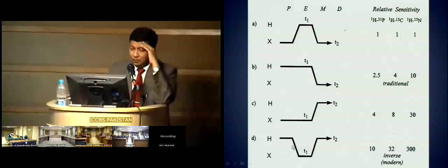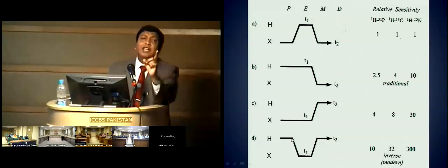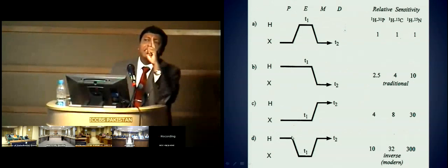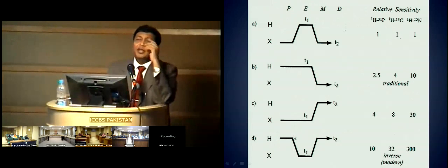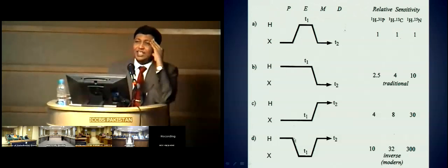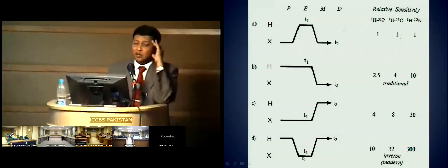Now here you have an interesting experiment in which you have a source nuclei as proton. Proton is transferred by exactly the same thing as you have done, INEPT. Kindly never forget INEPT. You may forget anything in the world, but never forget INEPT. So you have this INEPT, and you have this particular antiphase, and then you do a spin inversion, transfer it to the carbon, and then you prepare this carbon to transfer back to proton.